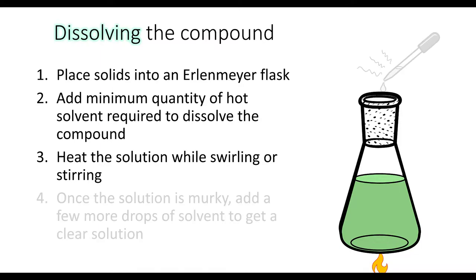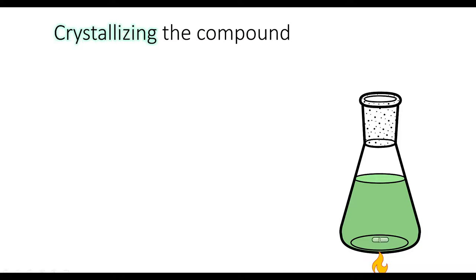As we're heating, the solution is going to start to get kind of cloudy or murky, and when we reach that point we have to add a few more drops of solvent to get the solution back to looking clear. Now we have to crystallize the compound.